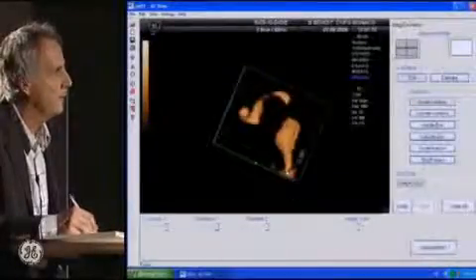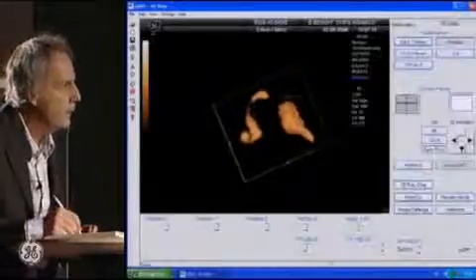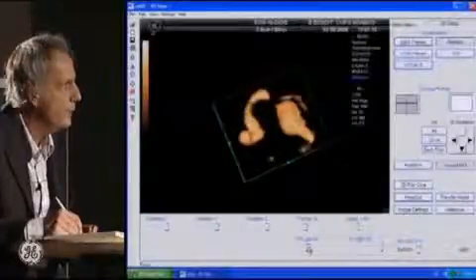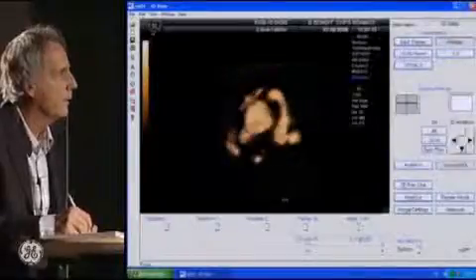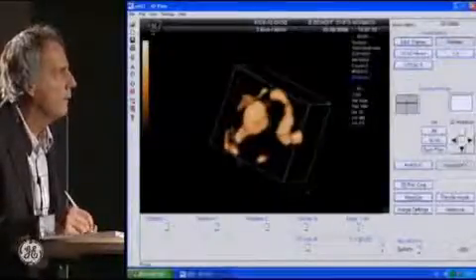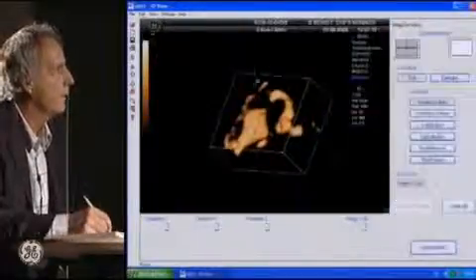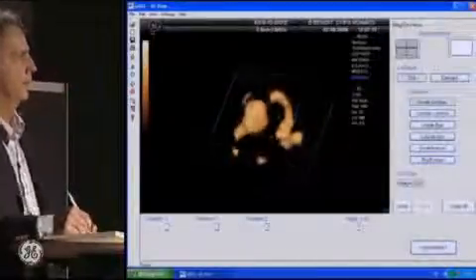Okay, and this is the brain of this embryo, and you can increase the threshold. When you increase the threshold, you will feel all the part, and you can see. And you finish cutting this.